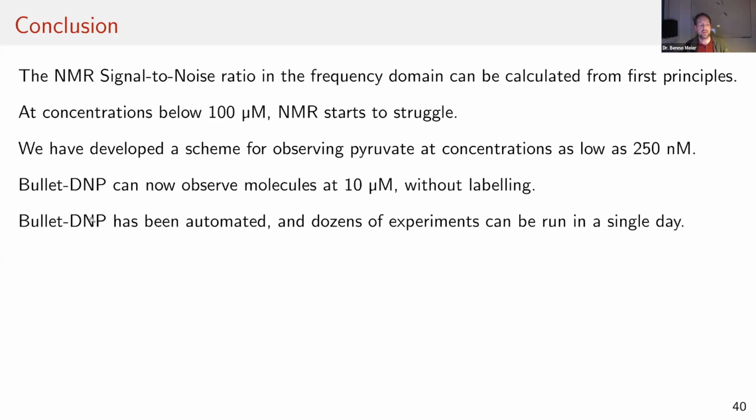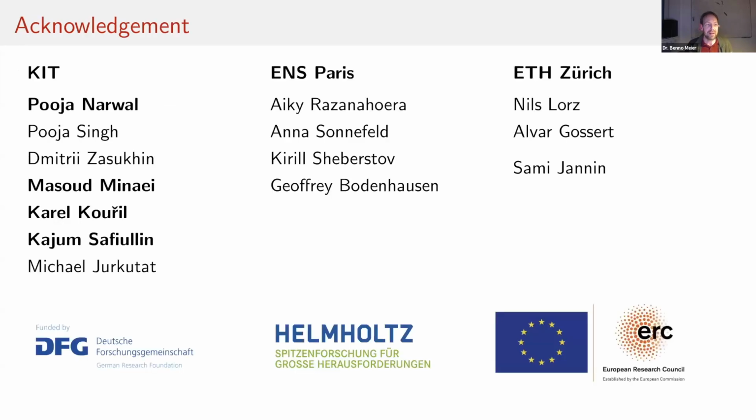And also, bullet-DNP has been automated, and so we can run dozens of experiments in a single day. Not every day, but it's rather frequent.